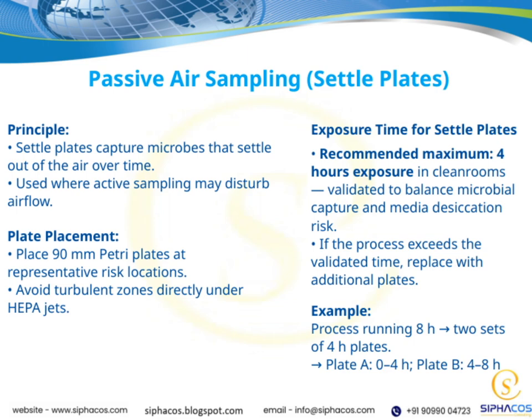This duration has been validated because it strikes a good balance. It allows us to effectively capture microbes without risking media desiccation. If the process needs to run longer than 4 hours, it's important to replace the plates with new ones to ensure accurate results. For example, if a process runs for 8 hours, you should set up 2 sets of plates, each exposed for 4 hours.